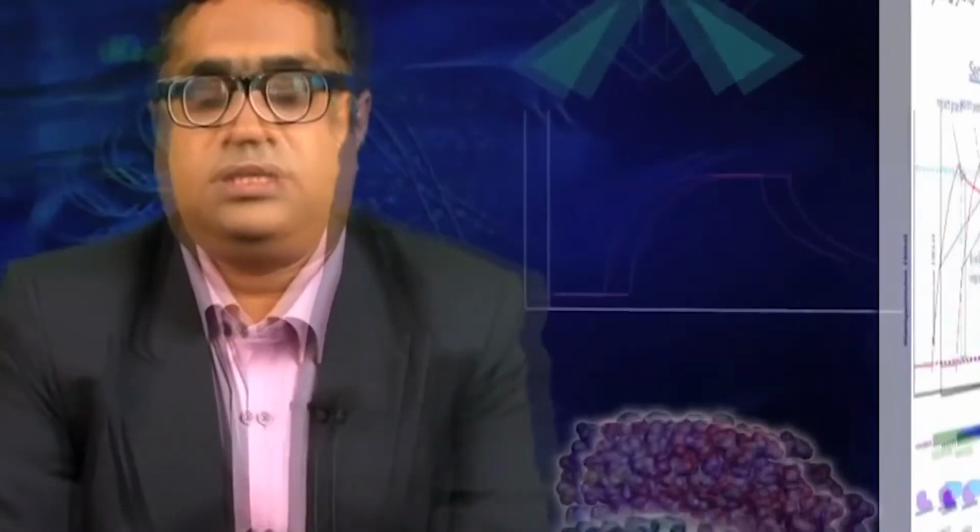The sensorgram that is generated from the Biacore or surface plasmon resonance experiments tends to give us different information. They tend to tell us whether there is binding. So, there will be a yes or no binding, and once there is binding, we will come to know if there is a specific binding or a non-specific binding. Once we have determined the binding, then we will understand how strong the binding is or how weak the binding is.